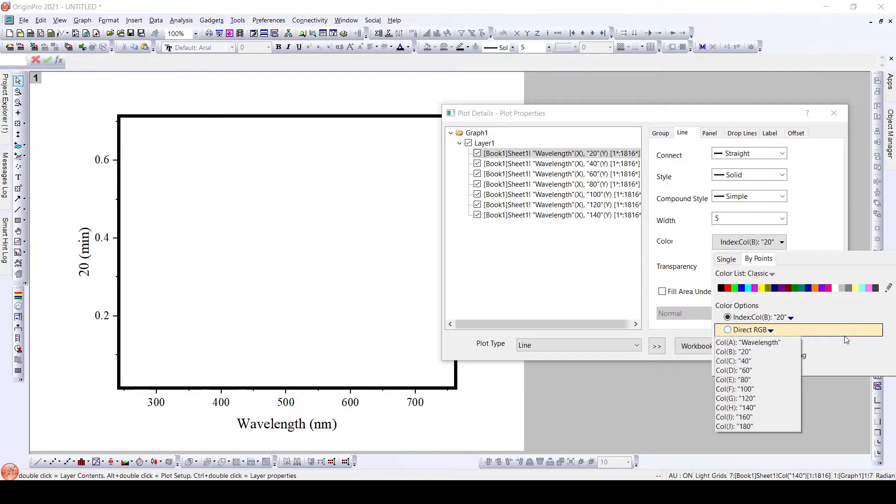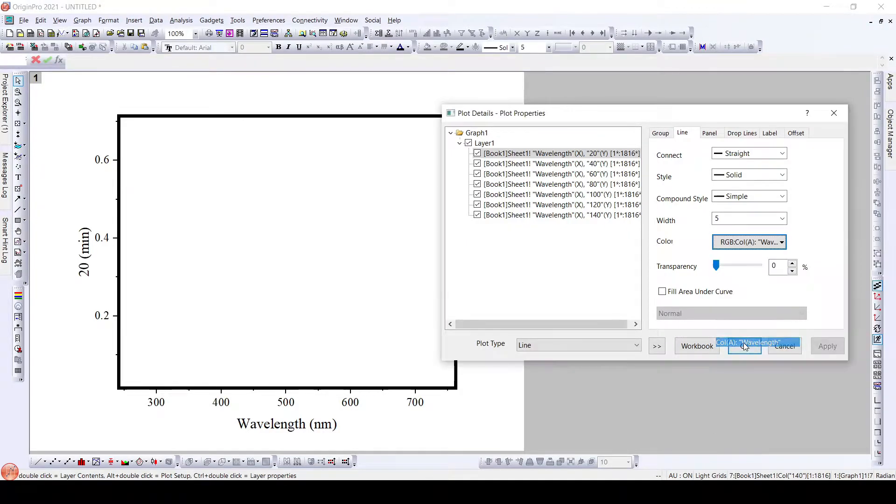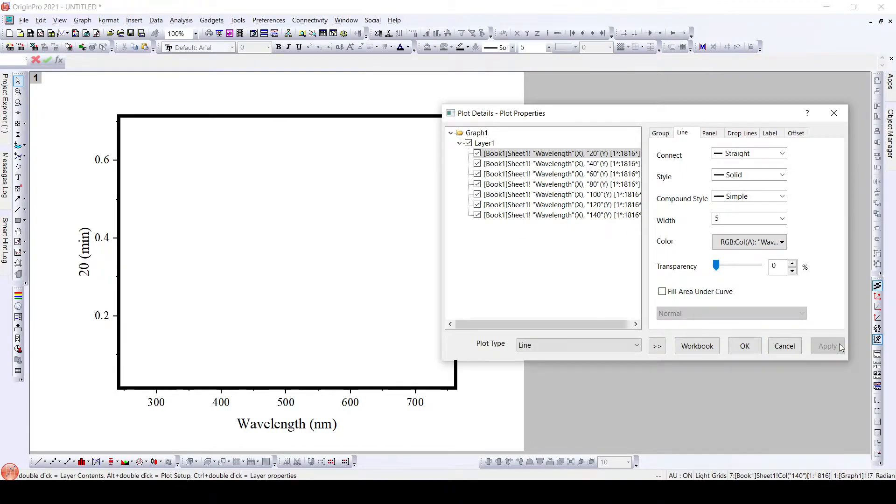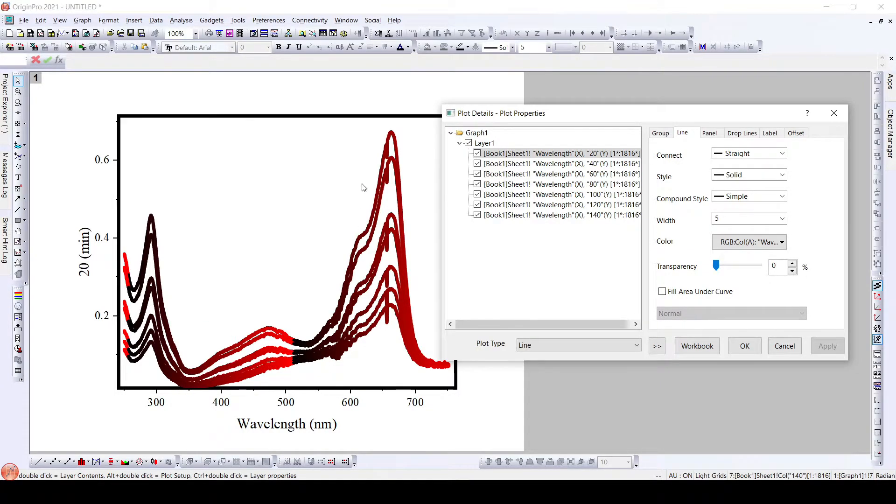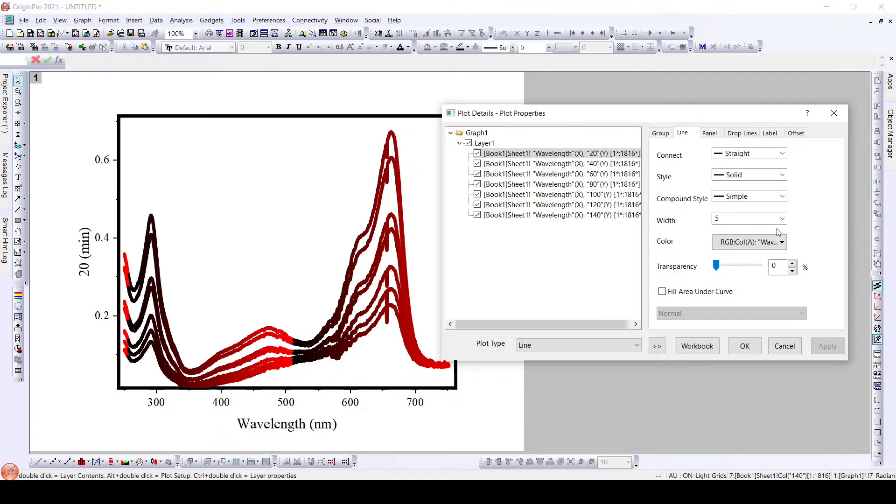So the second option that we have is direct RGB. Here also what we can do is we can select the wavelength and the colors in different sections will appear to be different or they are grouped based on the wavelength and we can see certain areas colored differently.